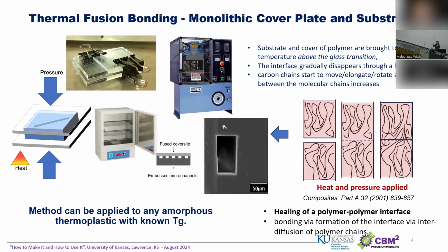When you fabricate, you fabricate a channel, right? You have a microchannel. You need to form a tunnel to actually perform the processing, right? You need to put a roof on top of that channel to create a basically enclosed structure. So in most cases, we perform the modification after we bond and assemble the device.